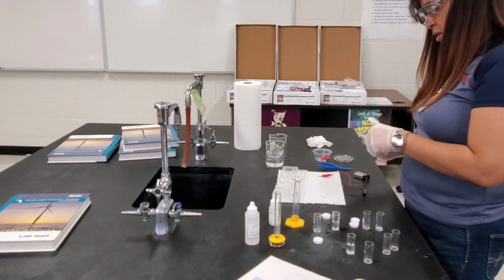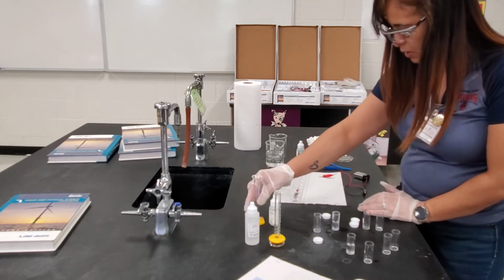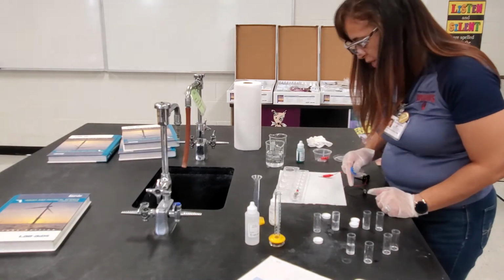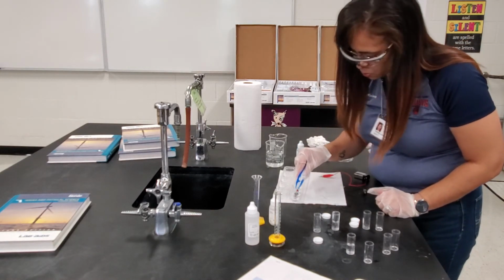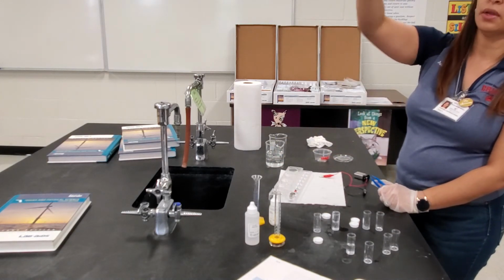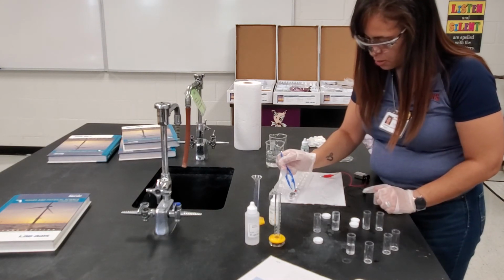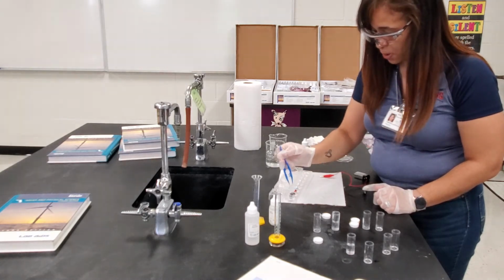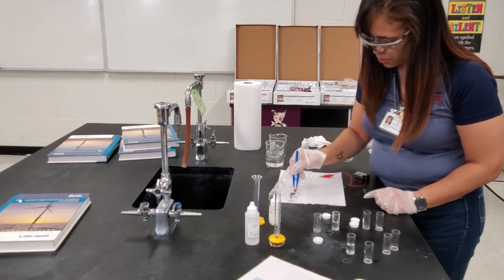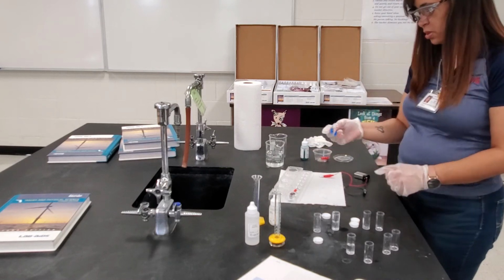Okay, so not sure if you can see this, but the two metal pieces definitely show a reaction. Okay, this one is foaming up. The copper chloride is a very pretty blue-green, but as you can see on the second piece here, it looks very dark. So both of the metals do have a reaction. And the red piece, there is no reaction. And the black piece, there is no reaction.